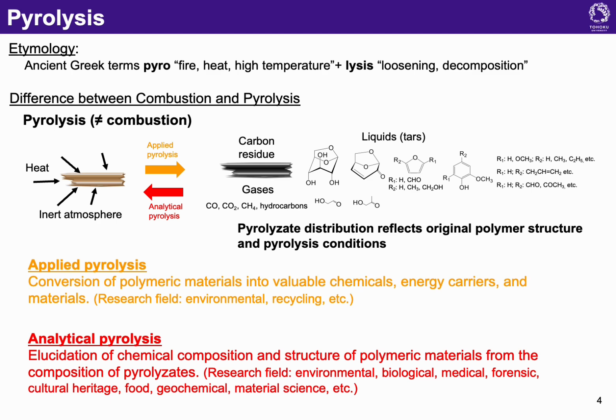On the other hand, analytical pyrolysis enables elucidation of the chemical composition and structure of materials in a wide range of fields, involving the use of new instrumentation and new analytical methods based on pyrolysis reactions. I guess that many of you in this symposium are working in the analytical pyrolysis field.